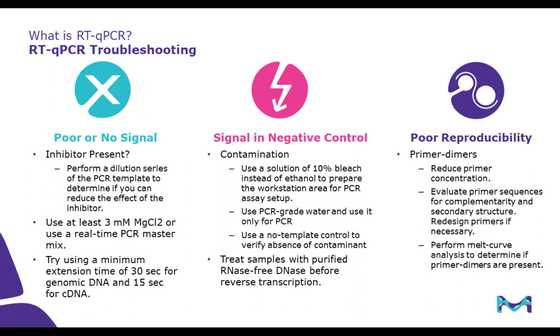Even when experiments are planned carefully, there can still be unanticipated issues. Poor or no signal may occur when an inhibitor is present — to combat this, perform a dilution series of the PCR template to determine if you can reduce the inhibitor effect. You can also use at least 3 millimoles of magnesium chloride or a real-time PCR master mix, and adjust the minimum extension time to 30 seconds for genomic DNA and 15 seconds for cDNA. Another concern is seeing a signal in a negative control — contamination is often the culprit. To avoid this, use 10% bleach instead of ethanol to prepare your workstation, use PCR-grade water only for PCR, use a no-template control to verify the absence of contaminants, and treat samples with purified RNase-free DNase before the reverse transcription steps.